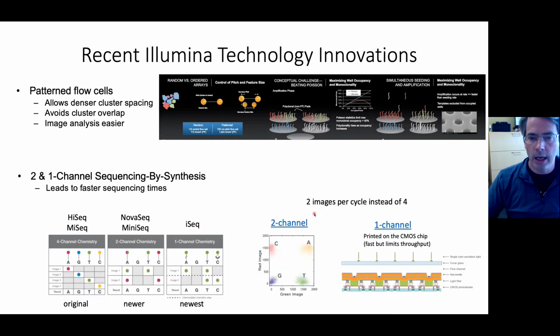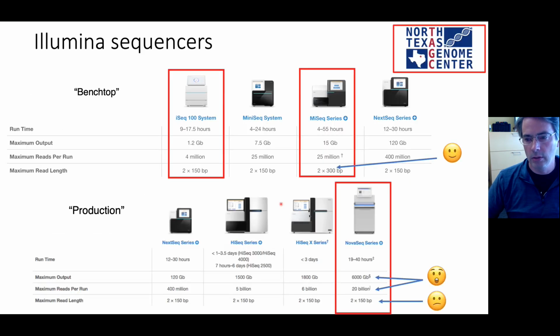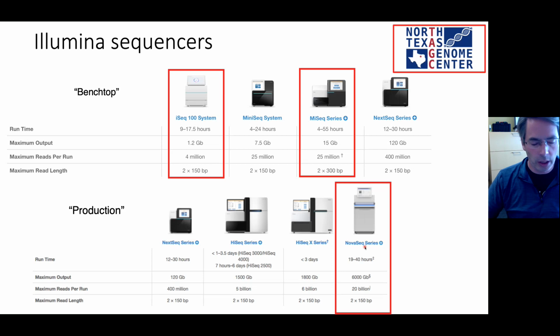And it's really that they are constrained. This technology is constrained by this whole fundamental way that it works, where you're sequencing by synthesis, needing to grow these fragments. Okay, once they start to get too long, they flop over, and you just, at least so far, can't read them longer. It's also partly the way they shoot it with a laser over and over again, that those enzymes degrade.